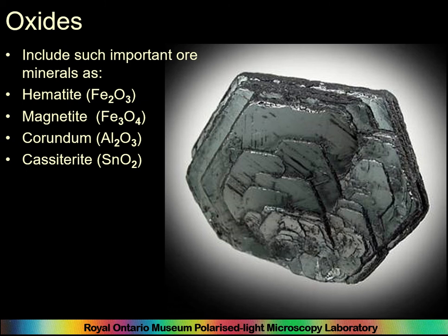Oxides, again, very important ore minerals. But things like oxides, like hematite, magnetite, iron oxides, and the sulfides, in a thin section, and we're just doing transmitted light. We don't do reflected light. But in transmitted light, all of these minerals are just opaque. And so you'll just be saying, this is an opaque. Under plain polarized light, under cross-polarized light, all you see is blackness.